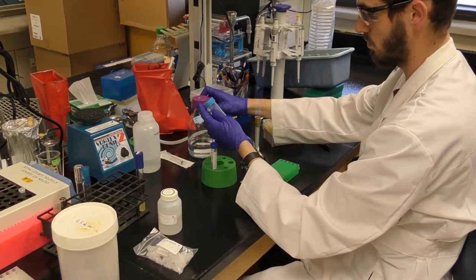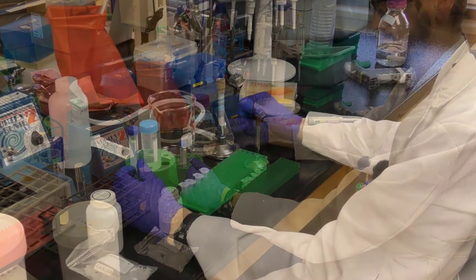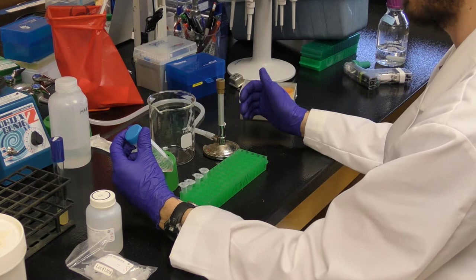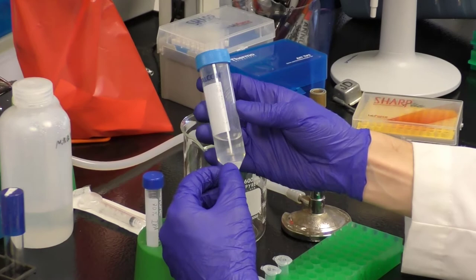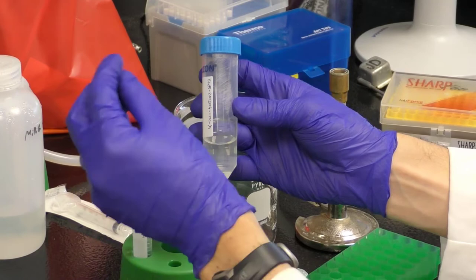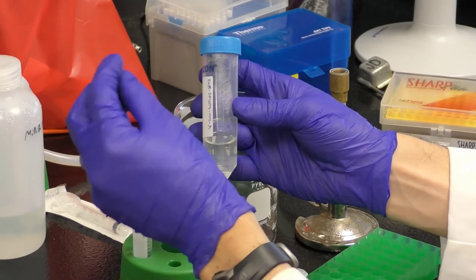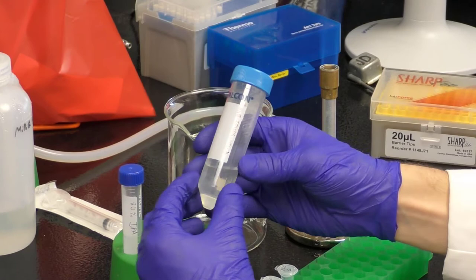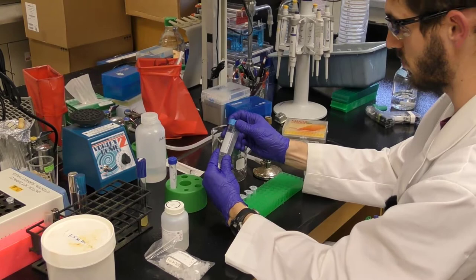You'll do this one day and then the next week come back and do your spin down for the concentration step. After letting this sit overnight in the fridge and then spinning down at the centrifuge for 10,000 g's for 10 minutes, sometimes you'll be able to see an area where the phage and PEG solution has actually bound to the side wall. If not, just note where it came out in the centrifuge — a good way is to put the name of the tube on the outside wall. After that, we're going to pour out the supernatant into a waste container. This does have potential biohazard, so make sure we bleach it before pouring it down the drain.